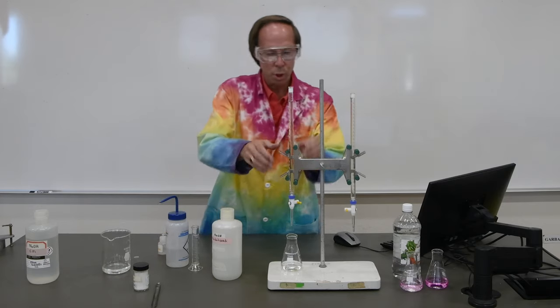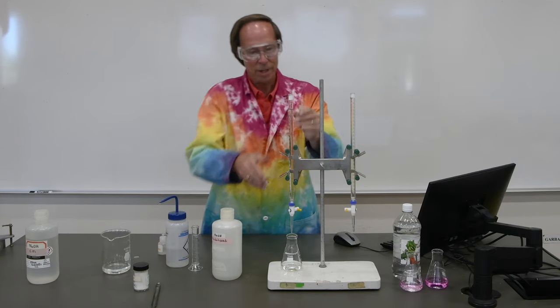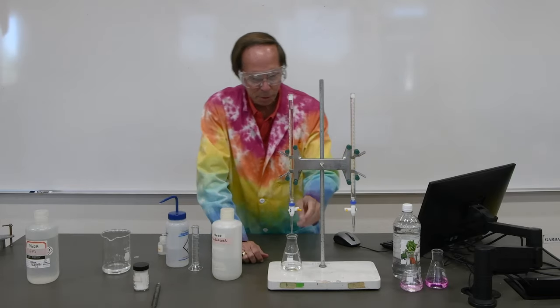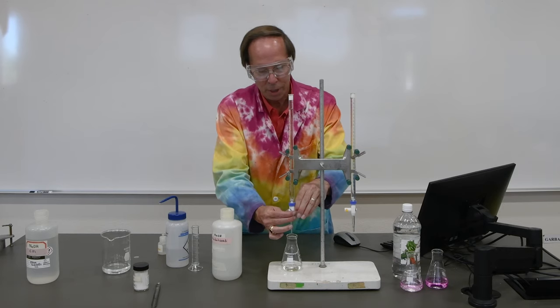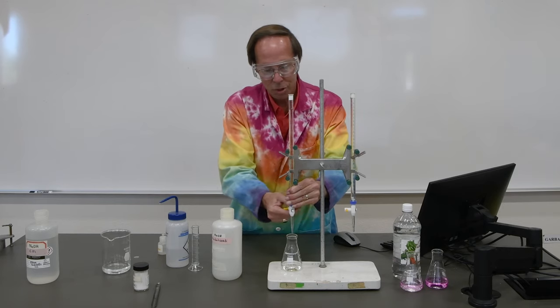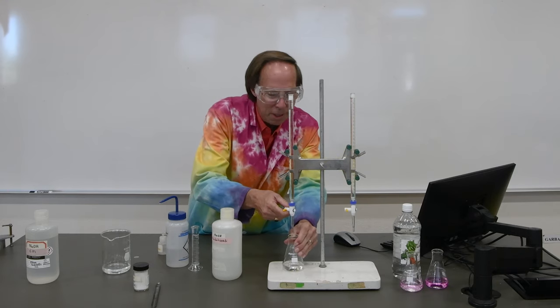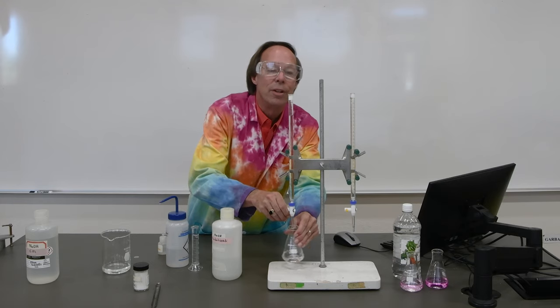So we'll go ahead and lower the burette down a little bit so it's just above the flask. And again, we should be able to go down to maybe 11.5 milliliters or so before we have to slow it down. I'm going to shift the stopcock around a little bit for those of us that are left-handed. So let's begin adding. We'll add that and swirl. There's a couple of milliliters.